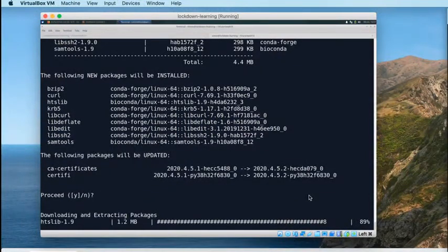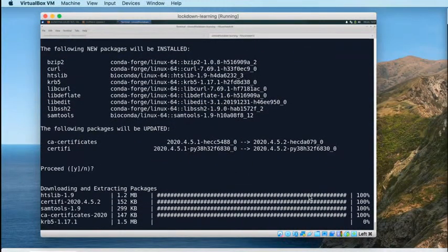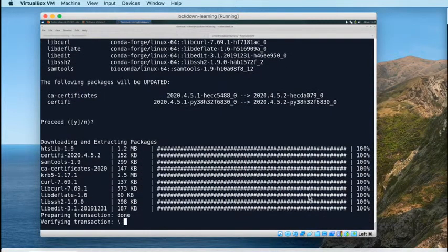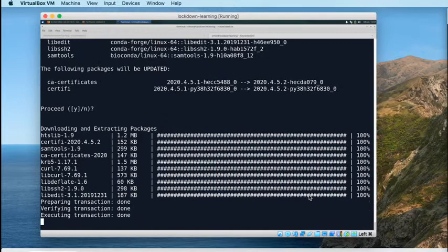So that's going to install, and once this is installed, we should have a binary on the system, an executable on the system, just called SAMTools. So we'll run that and take a look at the help information that comes with SAMTools. SAMTools is an executable which works a little bit like the thing that we've encountered so far that works most like SAMTools, which is Conda.